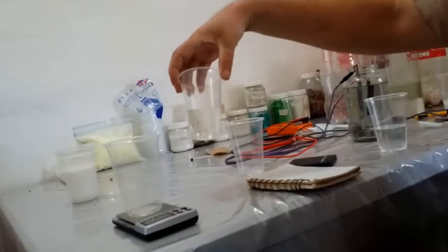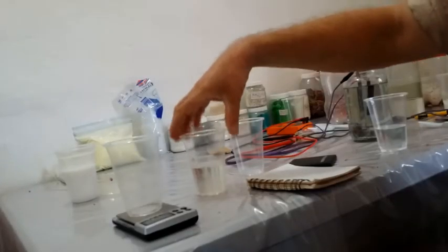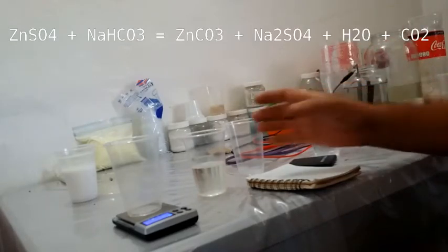This is the zinc sulfate that I've filtered in the last week. I need to make some zinc carbonate, so I thought I would show you just a simple double displacement reaction.